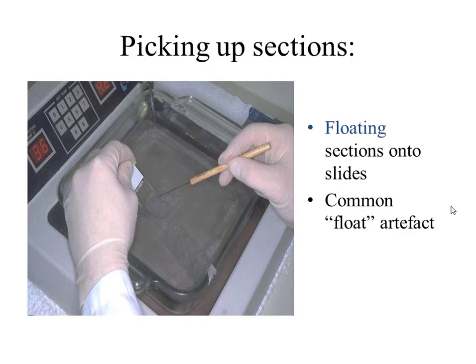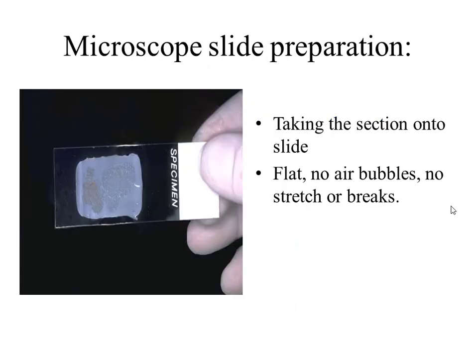Here you can see the hot water bath, where the pellicles with the tissue, with the material for investigation, are floating, and the laboratory assistant puts these thin pellicles with the tissue material onto the slide. This pellicle must be flat, no air bubbles, no stretch or breaks.